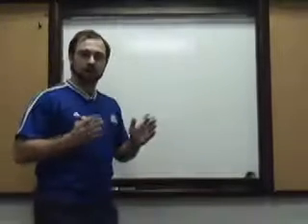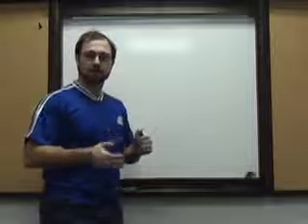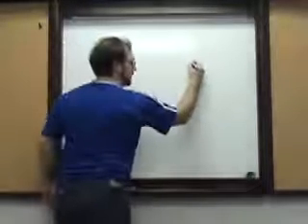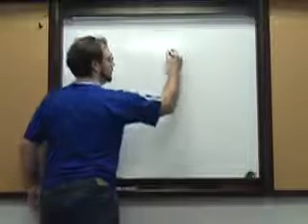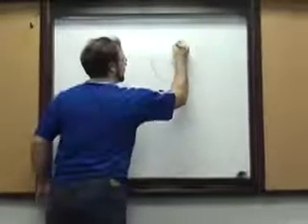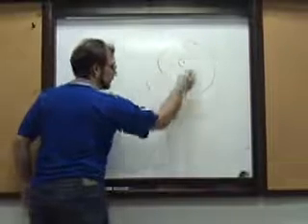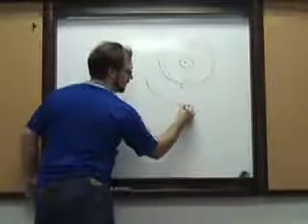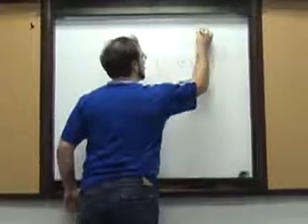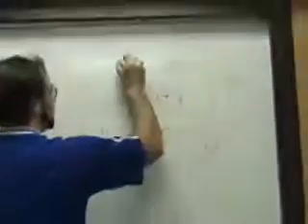I'm here to do a brief introduction on what XRF is and how it works. So we start off with a very simple model of the atom, with the nucleus in the middle, and as I go out, I have different energy levels. As I move further away from the nucleus, I have different energy levels of electrons out here. And each ring has a certain number of electrons that it can hold.